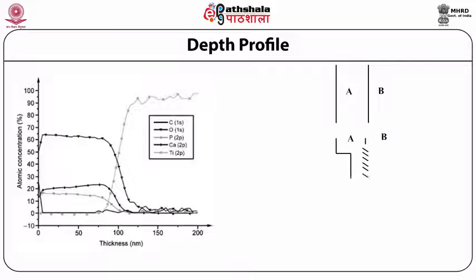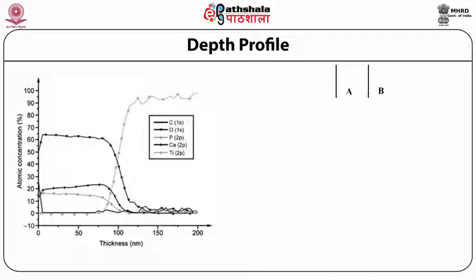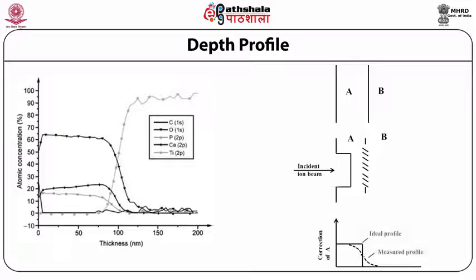Quantitative analysis of a depth profile, in addition to quantifying concentrations, requires accurate depth measurements. There are several factors for resolution of issues raised in depth measurements. First, the etching rate for each type of atom is not constant even though the ion beam energy and ion density are exactly the same. The consequence of this phenomenon is that preferential etching occurs in samples containing multiple elements.